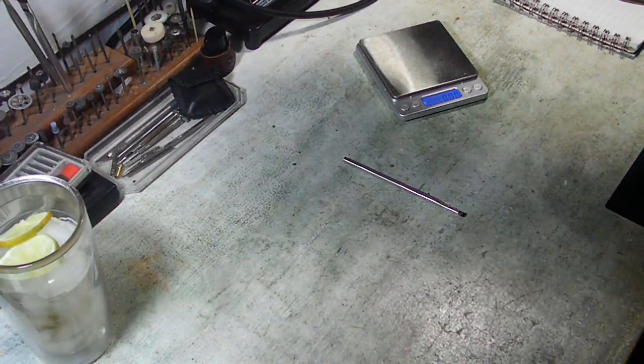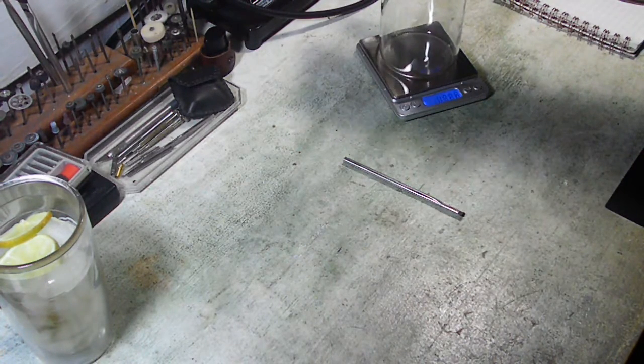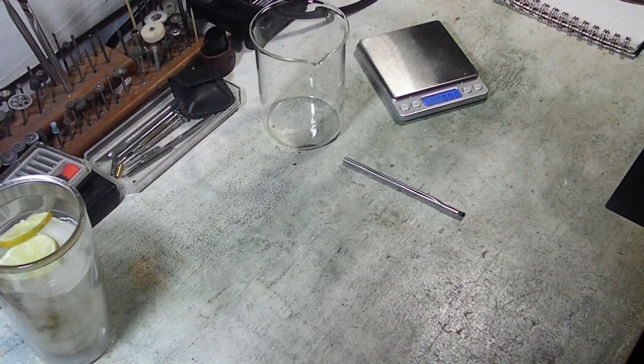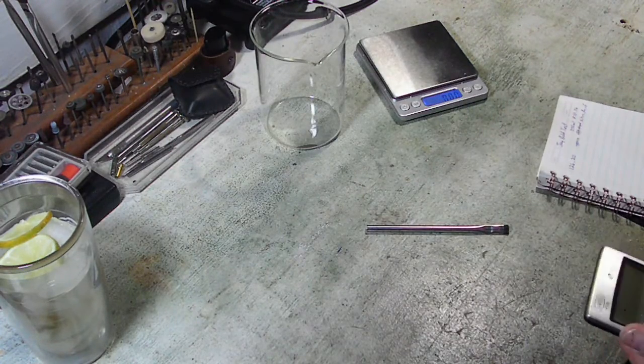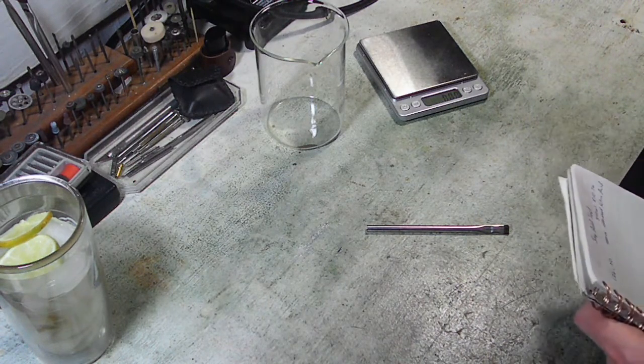This beaker weighed 162 grams, 0.76. So now it weighs 162.85. So that is 9/10 of a gram of gold. Or excuse me, 9/100ths of a gram of gold. Let's see, 162.85 minus 162.76 equals 0.09 grams. So almost 1/10 of a gram. Okay, so we got 1/10 of a gram.